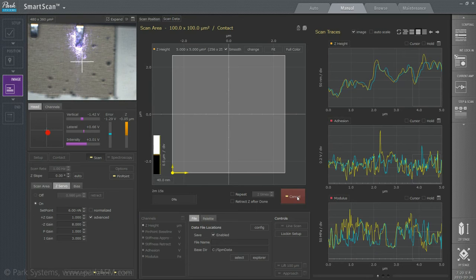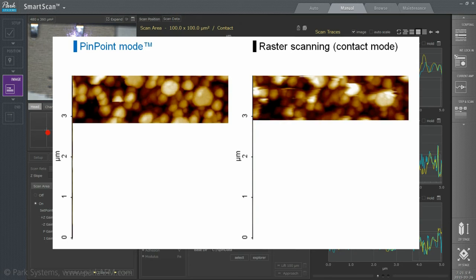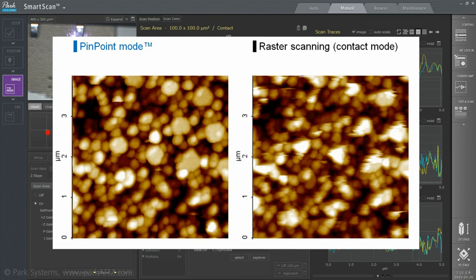During measurement, the isolated Z movements of the probe allow Pinpoint to offer significant improvements compared to conventional AFM raster scanning imaging modes. Because the cantilever tip is lifting perpendicularly from the sample surface at every pixel for imaging, more accurate topographical information can be acquired compared to raster scanning, even if the sample surface is extremely delicate or adhesive. Pinpoint is also easy to operate for novice AFM users and can image everything, even steep edges, soft or sticky surfaces.